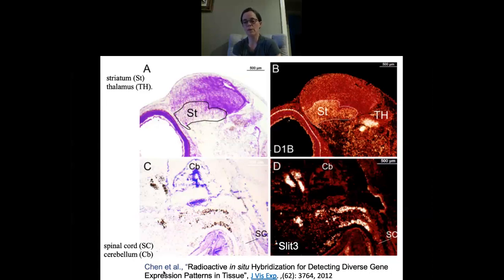So in the upper left image at embryonic day 10, where the genetic expression of the protein is low, the absorption of the emulsion is barely visible in bright field. But in the dark field, it shows up well.